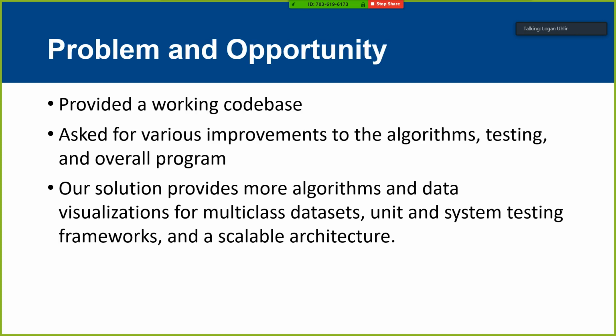So GC Image came to us with a working code base, and they were asking us to make various improvements to the algorithms and adding new classification methods, and they wanted more testing for the code base as well as just various improvements for the program overall.